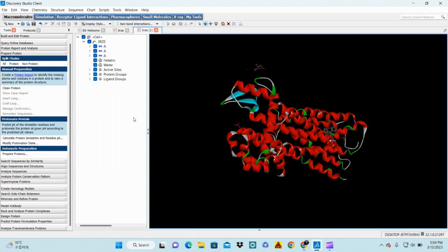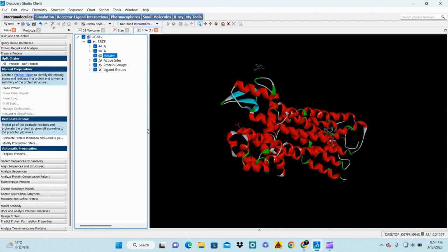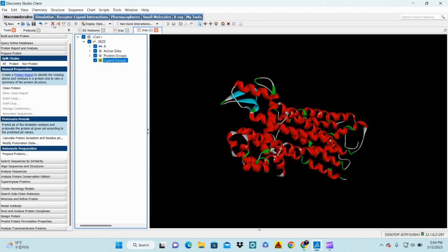First, moving toward preparation of the protein, you need to delete some things from your protein structure — extra molecules, hetero atoms, and ligand groups all need to be removed. After that you are left with the chain, the active site, and the core protein groups.